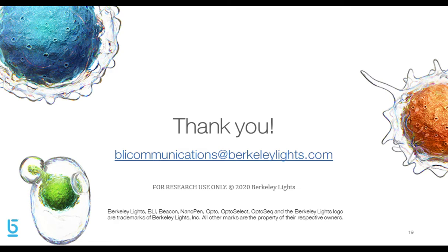Great, thank you. Okay, your next question here says, do you work with other surface proteins of SARS-CoV-2 for the antibody production? Our own internal experiences have been with panning against the spike protein as well as the RBD of that spike protein for SARS-CoV-2. In principle, all of the other surface proteins of the virus can be assayed and antibodies can be selected for them. And I believe that we have customers that are targeting a wide array of different targets on the virus.